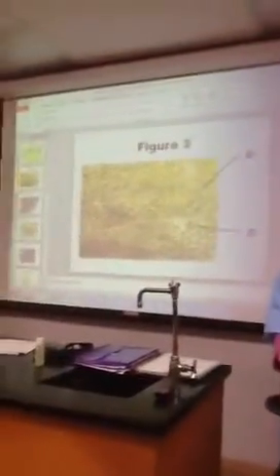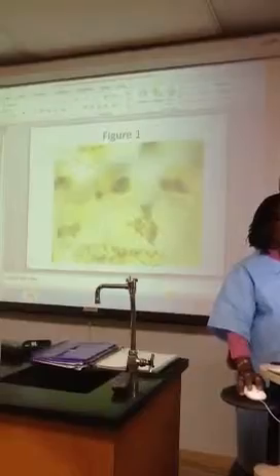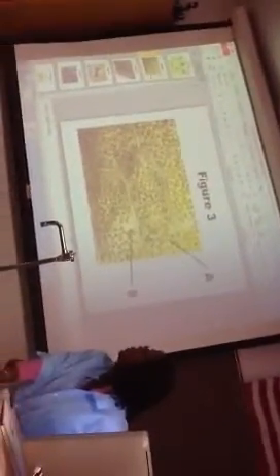Okay, as compared to this. Okay, so I can ask you, what are these? What is the process? And I can ask you, what are those? And of course you know, that's your what? What are these little things here? Sister chromatids. Chloroplast.